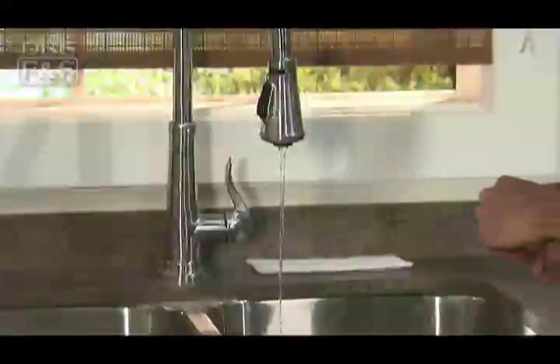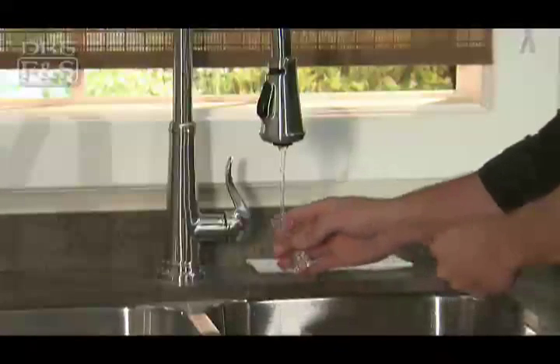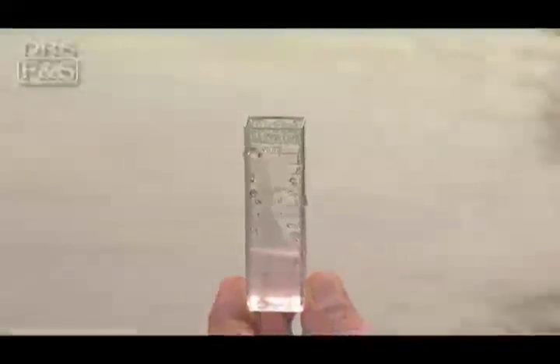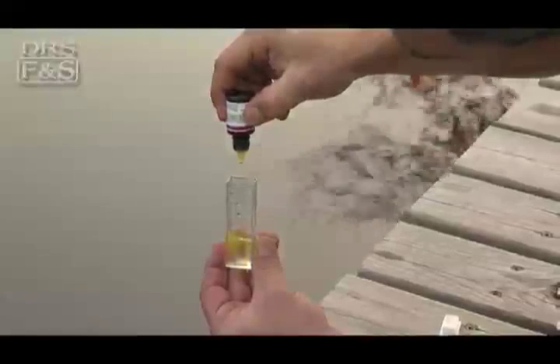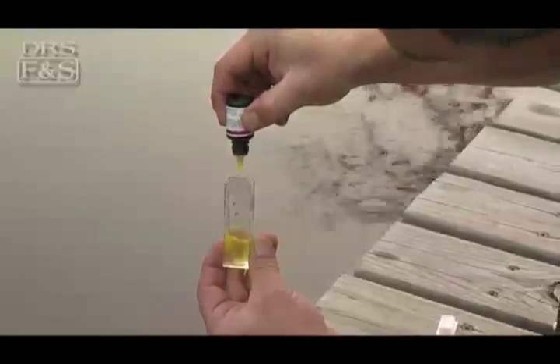Before you begin testing with a chemical test kit, rinse out your testing vial with clean water. Then draw out a sample of your pond water according to the manufacturer's recommended fill line on the vial. Next, add the exact amount of test chemical included with the kit according to the manufacturer's directions, and mix the contents.